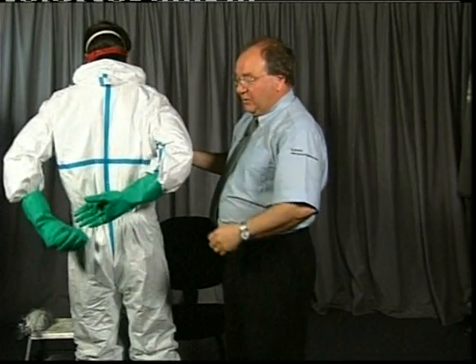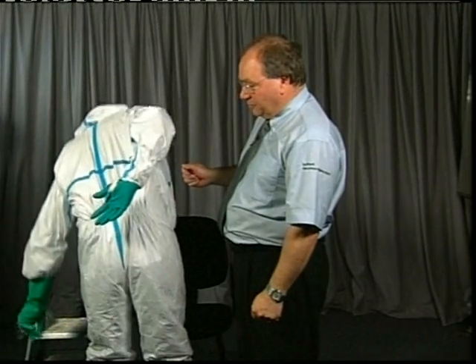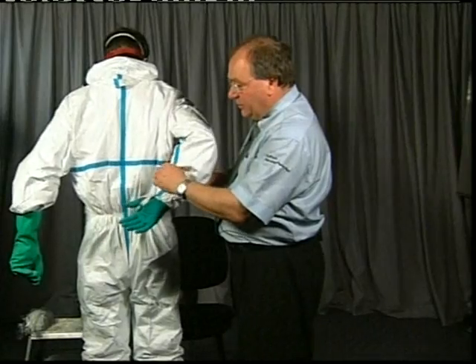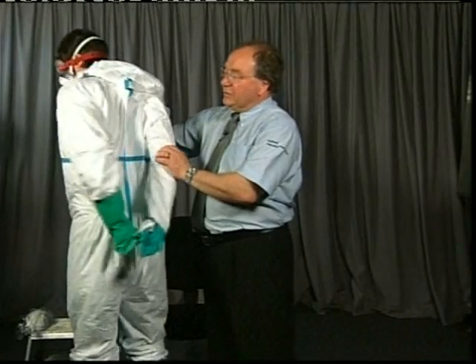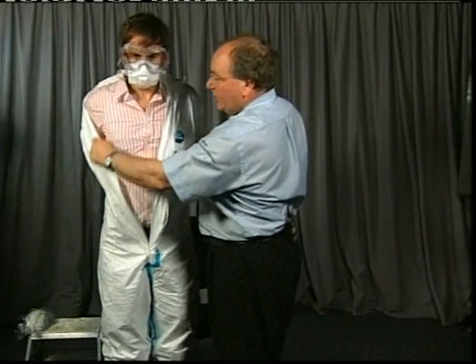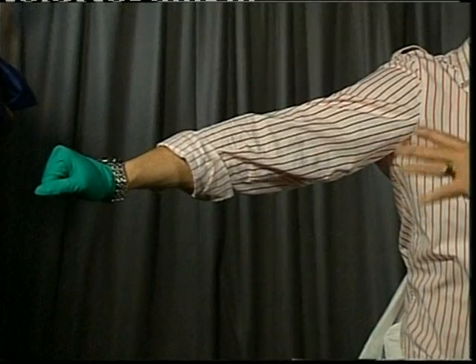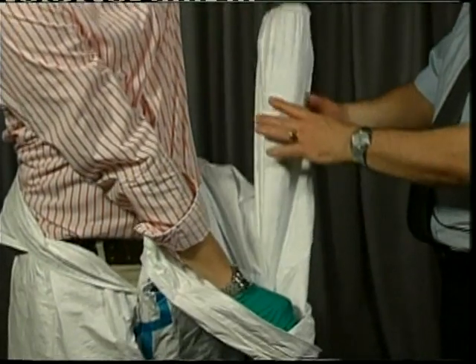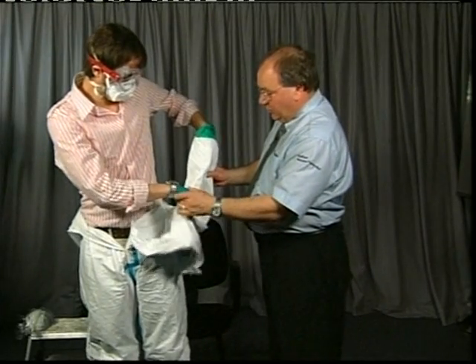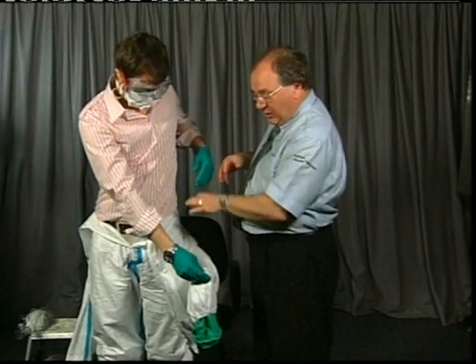To remove the gloves and suit, take the outer glove off — that's a contaminated glove, drop it. Take your bare hand back and grab the sleeve. Pull that sleeve down, taking that arm out of the suit. You now have a clean hand which has not been contaminated. Put that clean hand inside the suit, peel over, then take the hand with the remaining glove, grab it, and pull — that takes the glove away and contains the contamination. You now have clean hands. Roll the suit down and sit down.